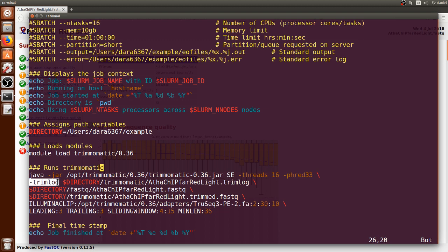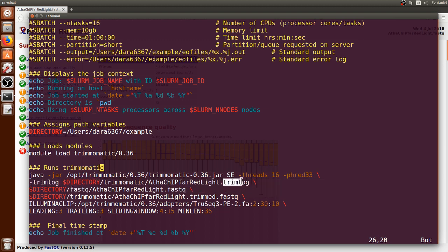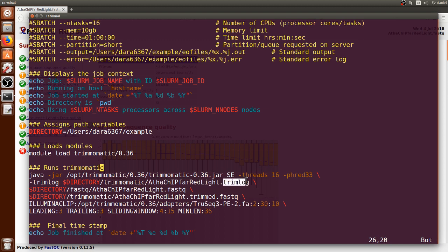Then we put dash Trimlog, and where we want to save the Trimlog. In this case, it is in the directory that we just created, Trimmomatic, and we're using the same prefix of the FASTQ file and just add the Trimlog suffix.